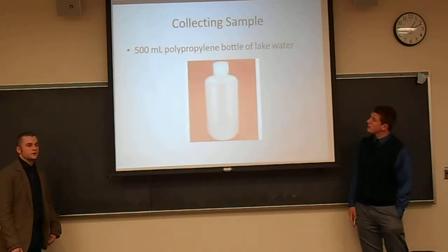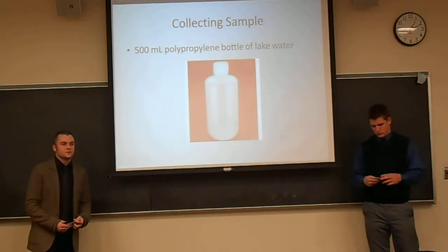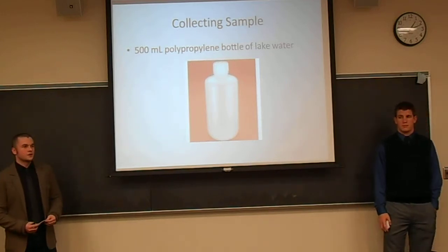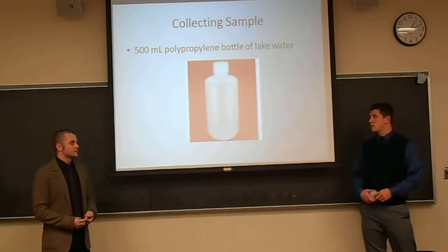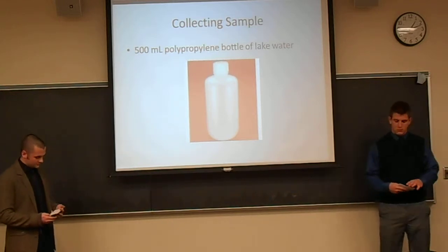Alright, so to start off our experiment, we used a 500 milliliter polypropylene bottle, and we chose a random spot at the lake to take a sample. We filled the bottle up about halfway, put the cap on it, and then shook it up for about 2 minutes, and then dumped the water out, and we repeated this process 2 more times. Once that was complete, we filled up the bottle completely, capped it, and then brought it back inside.